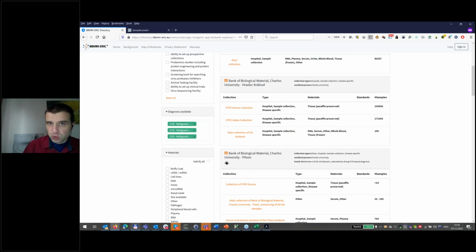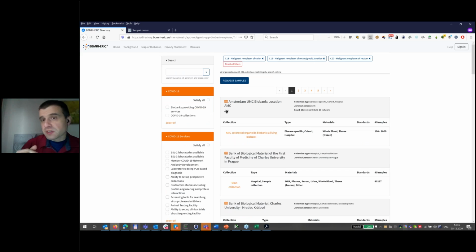However, what it does not do is if you're searching for something specific, it does not find more general things. So if you're searching for C18.1, it does not search also C18 because that would make things cumbersome for you because you're searching for something very specific. However, sometimes you manually want to do this more generic search. So in this particular case, the ICD-10 codes are also forming upward hierarchies. They're forming blocks and chapters.